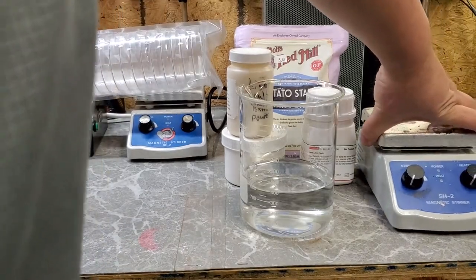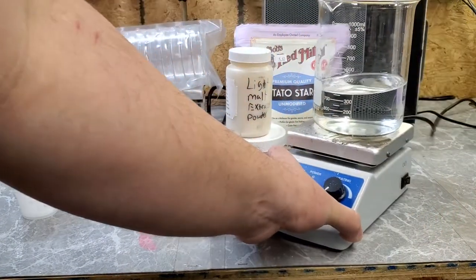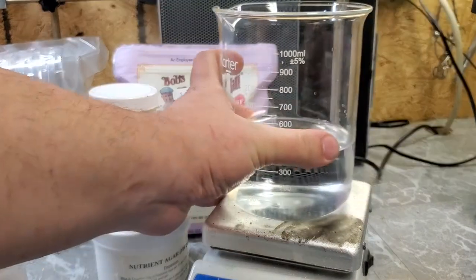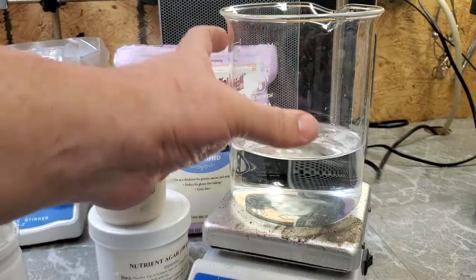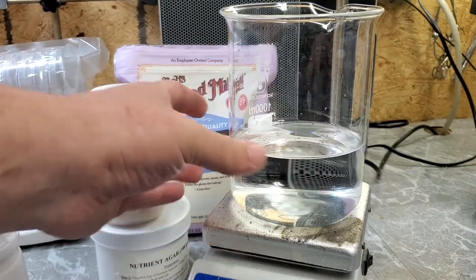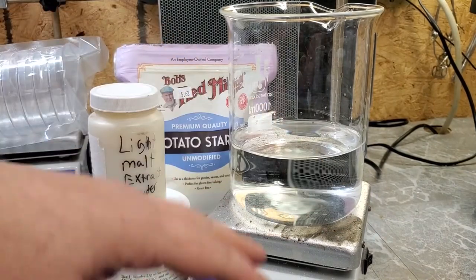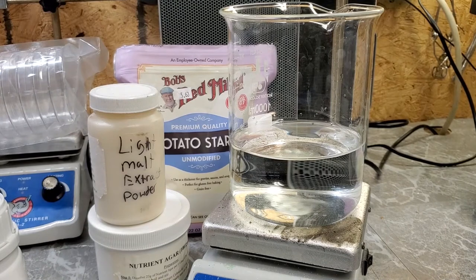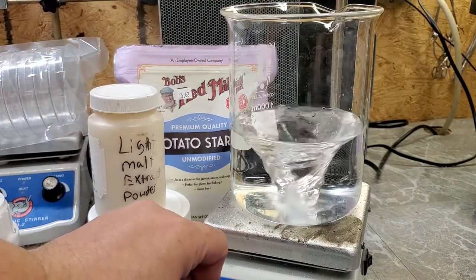I know I said I wasn't going to use the boil method, but I am going to bring everything up to a boil before I put it in the instant pot. I've noticed that if you don't at least bring things up to a decent temperature before putting them in a pressure cooker, the powdered agar stays at the bottom and you get very inconsistent viscosities when pouring your agar into your dishes.